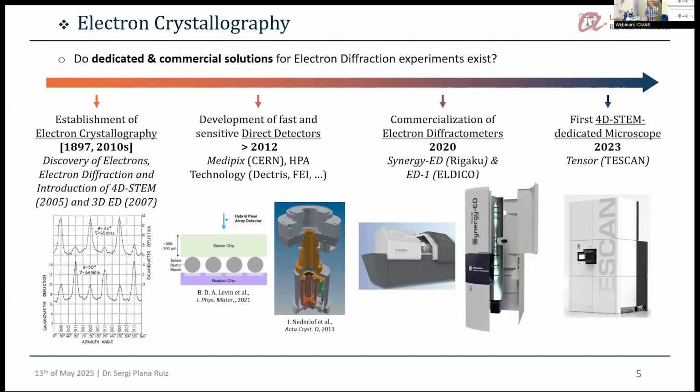So nowadays there are commercial solutions, but they are only focused on these specific techniques, while with the TEM you can do much more. For example, for a diffractometer that only collects 3D data, we have these two machines from two different companies, but nowadays there is also another dedicated microscope for 4D STEM applications from the Tescan company, which is based on this kind of analysis.